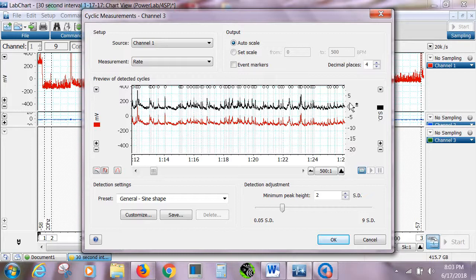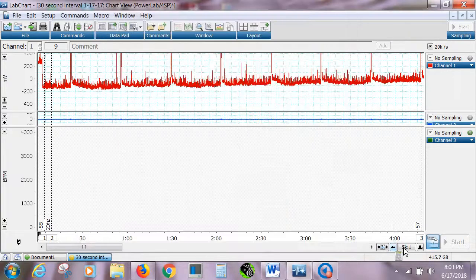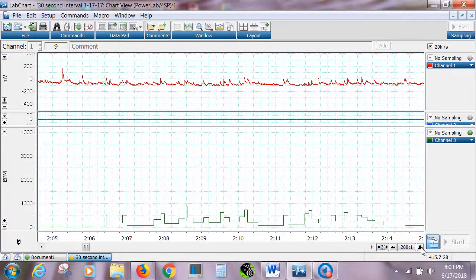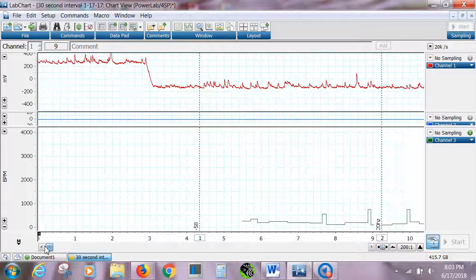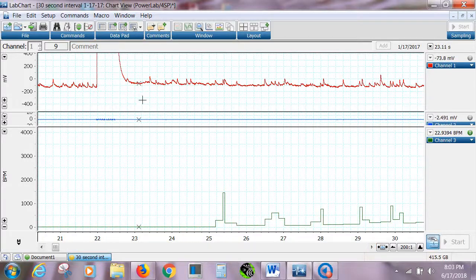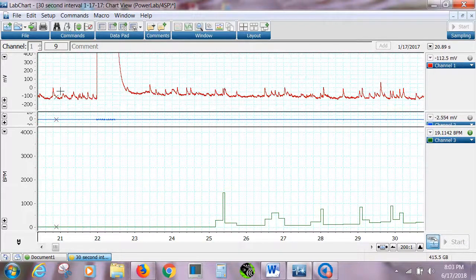Oh yeah, and I forgot to tell you that you can spread out your file by going right here too, clicking on this little thing, and you might want to try to count even this way if you want to. You can spread that out like this, and you can scroll on over. There's that first one, 23, and you see here, maybe that looks better. There's 23, 1, and you want to go 23.5, and then 24, 24 and a half, 24 to 25. Maybe you want to count that way. However you want to do it, right?